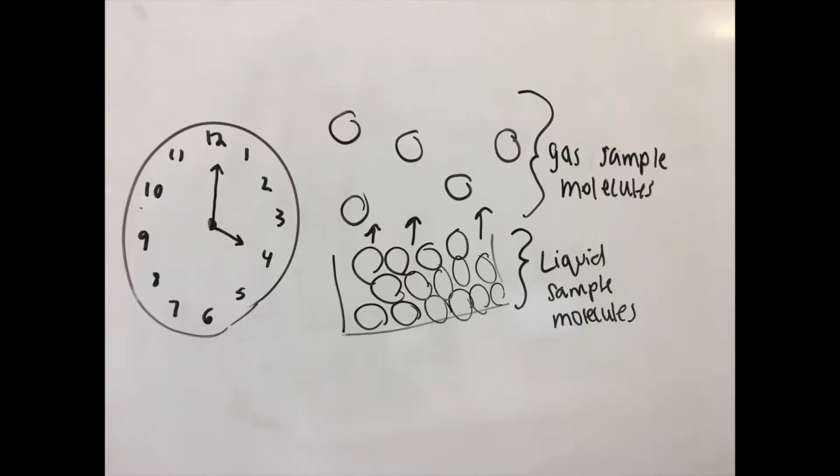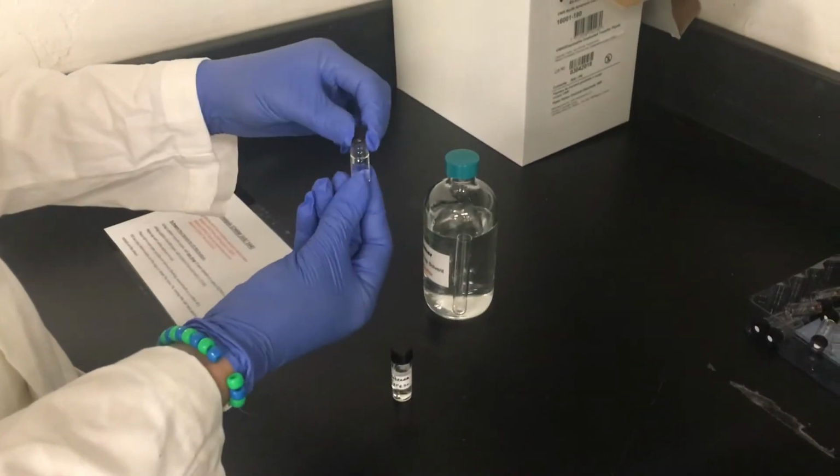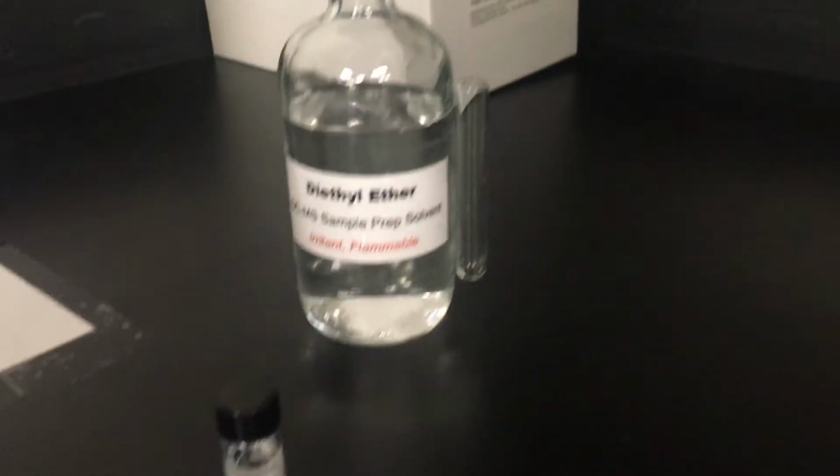The second method we chose to use was GC. GC relates the frequency of molecules in a substance to its retention time, or the amount of time it takes for the substances to exit the column in the gas phase. This differentiating characteristic is the strength of the intermolecular forces. If the forces are weaker, the substance will have a shorter retention time. If the forces are stronger, the substance will have a longer retention time. This tells us the relative strength of the intermolecular forces within a substance, as well as the number of components to a substance. While this was not extremely important to our identification, we submitted the sample to run the very necessary MS.